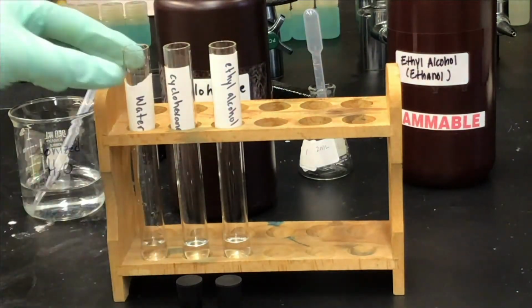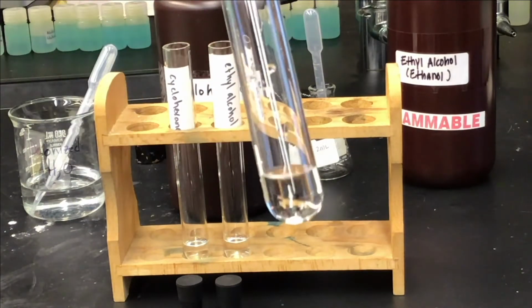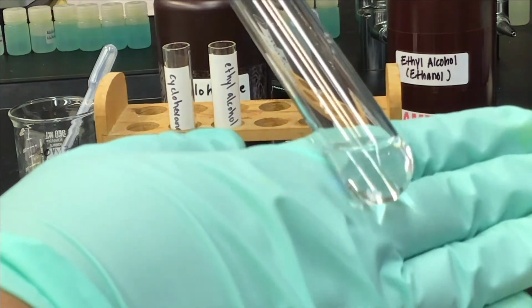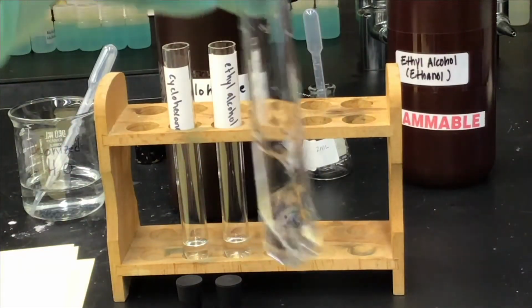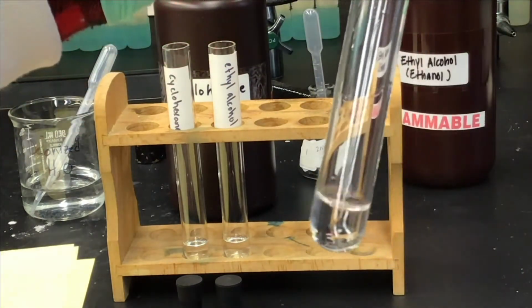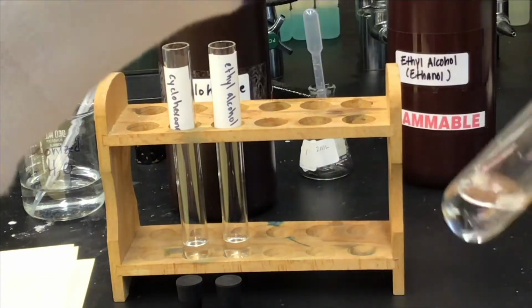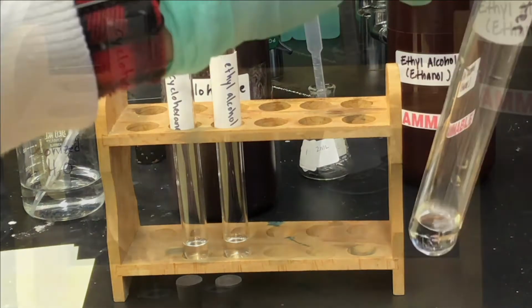We're then going to take a rubber stopper and place it in the opening of each test tube, and one by one shake our test tubes in succession. Doing this will allow us to see which substance our naphthalene is soluble or insoluble in. It may be difficult to see, but there are crystals still remaining in our DI water test tube.